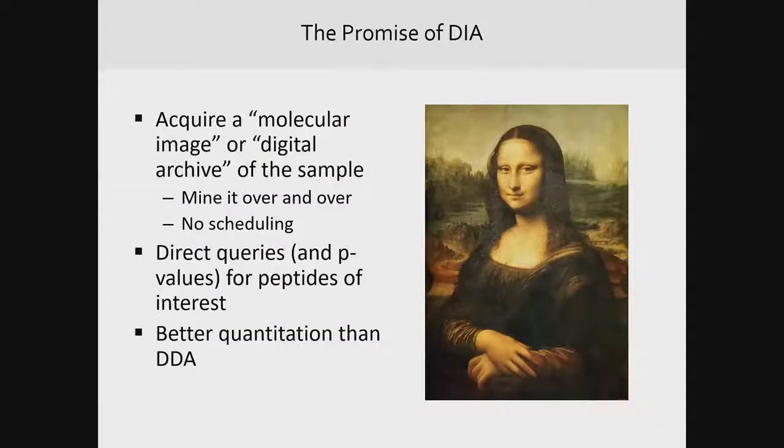Okay, so the promise of data independent acquisition. I love that when Ludovic's paper came out, they used, I think, this term, or it was at least used around that period of time, this idea of a molecular image or a digital archive of the sample. You can mine it over and over. There's no issues with scheduling. The scheduling is kind of the complexity of doing truly targeted proteomics, because in order to get good quantitation, you need to measure your analytes over just a narrow period of time.